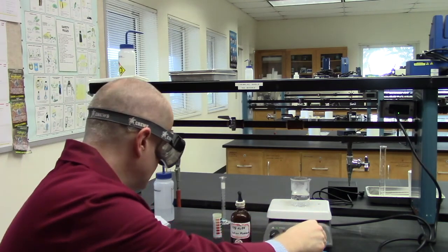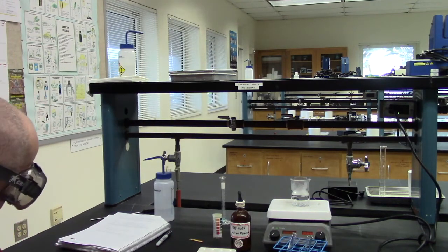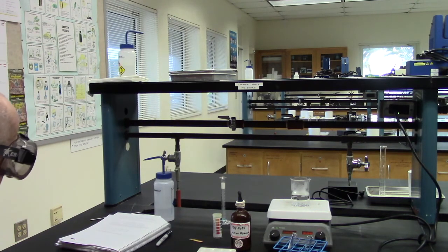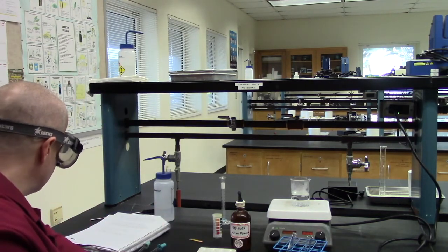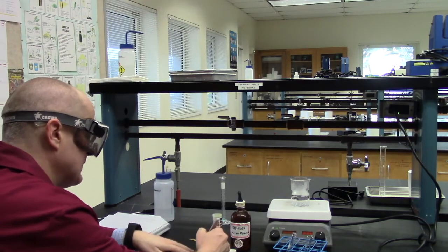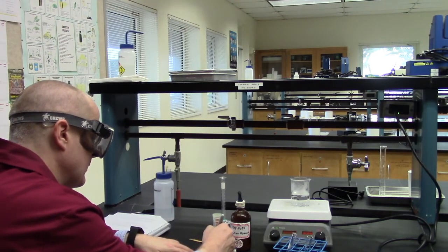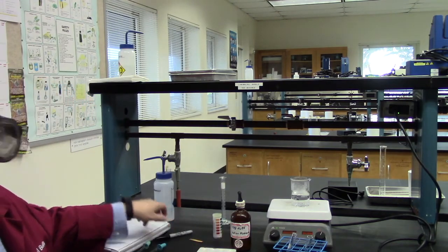Now, at this point, we want to get a sample of each one. So now I'm going to take a spot plate. I'm doing the iodine starch test on page 114. I'm going to take some of the one labeled acid. So let's put an A over here, and then we'll put a W here for the water and acid. Let me get my other camera adjusted here, guys, and I'll show you what I'm doing.